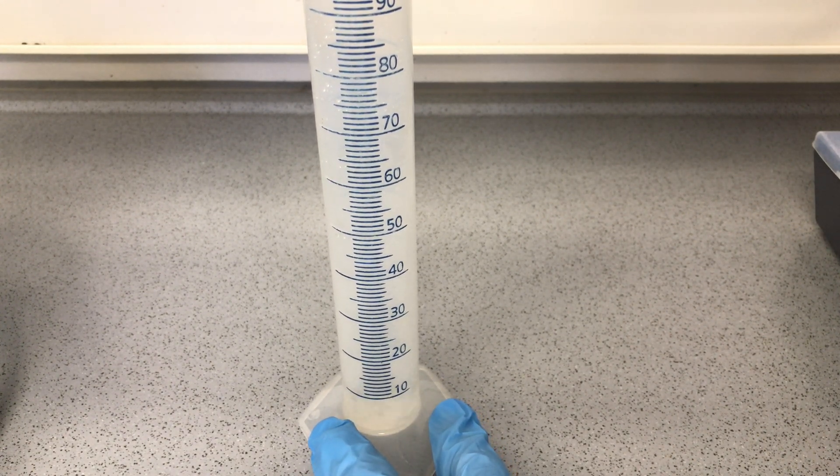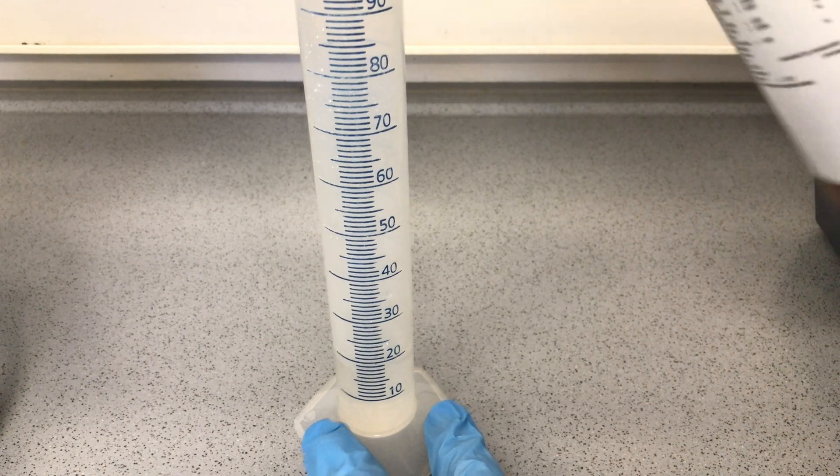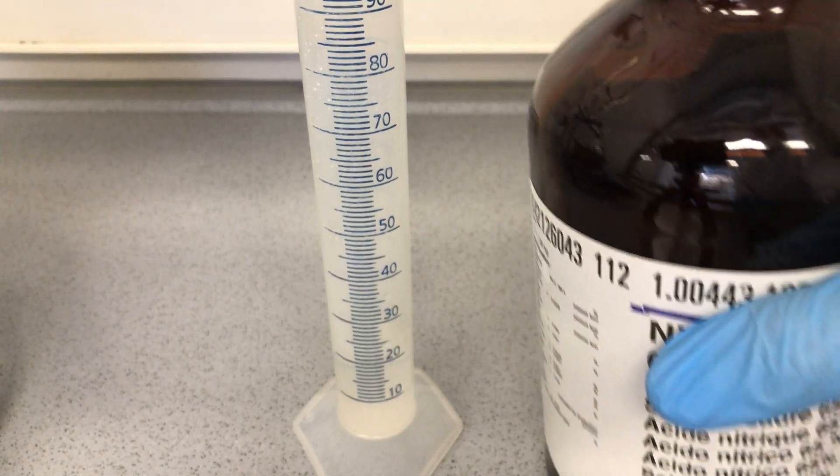We began by measuring out 14ml of nitric acid. As you can see I added way too much and I poured some of it off later on.